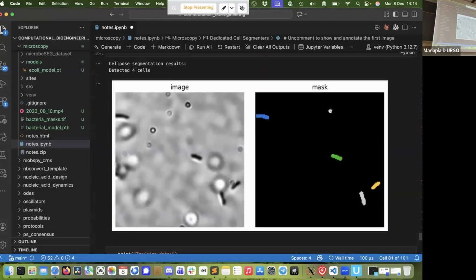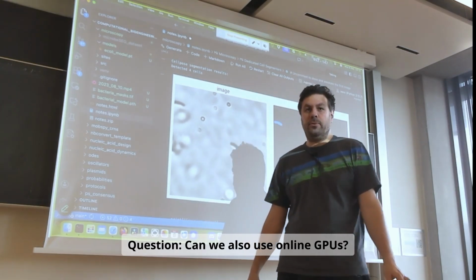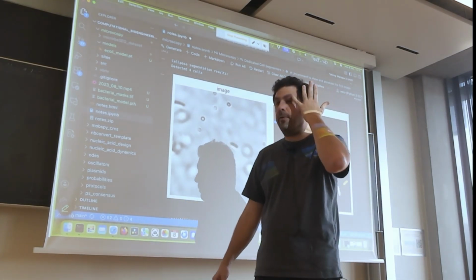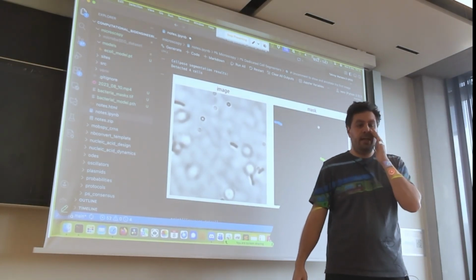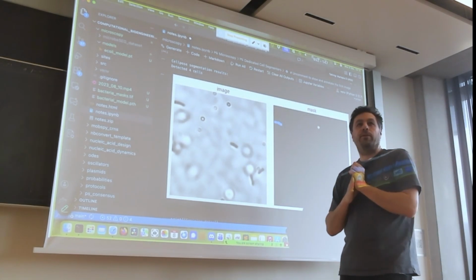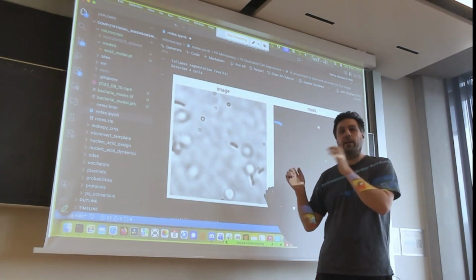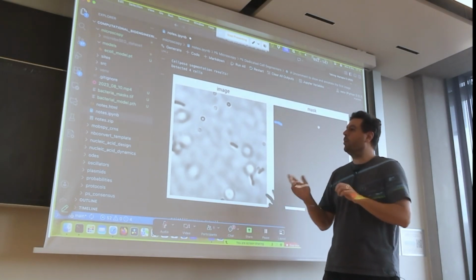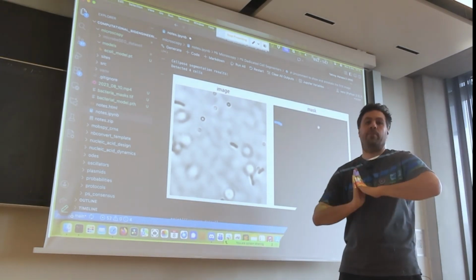There is a question from Zoom. Yeah, definitely. Several of our students do this. They use Google Colab, and you get GPU time. It's definitely possible. I just didn't try it out here with this notebook. I think it's always a bit tricky to upload your data into Google Drive and then get it inside. It comes with a bit of data, not too much, and I think the model alone is around 1 gigabyte. We didn't test it, but it should be totally possible.